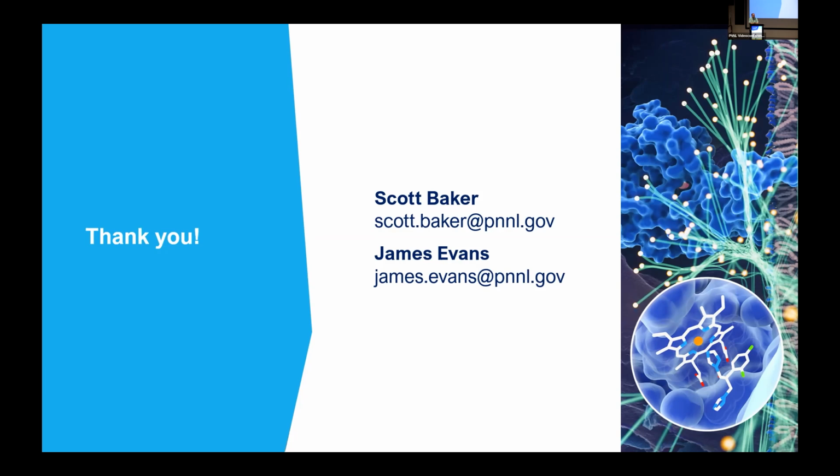The other question I had was, do you use commercial kits for the wheat germ and human lysate? We use commercial kits with some modifications in-house that have proven to be more reproducible than just the standard procedures, but yes. Okay.